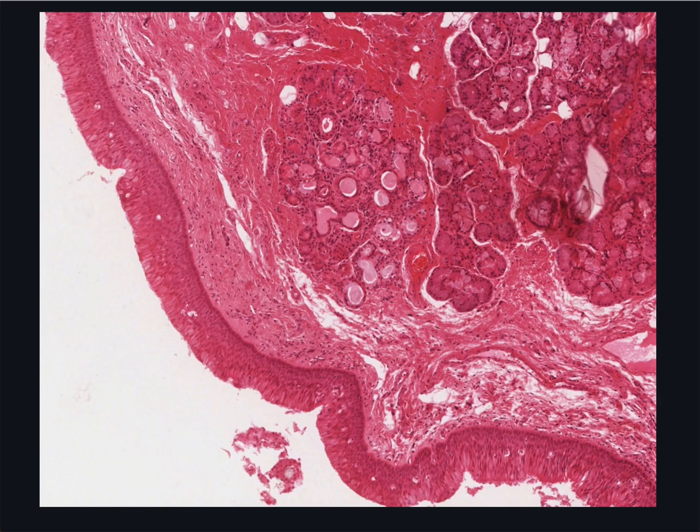The ventricular fold or false vocal cord is covered with typical but thick respiratory tract epithelium, and large numbers of mixed glands, both serous and mucous, and their ducts are in the submucosa. Not visible here, but worth knowing about, is that lymphocytes almost invariably infiltrate into the tissue around the ventricle between the false and the true vocal cords.